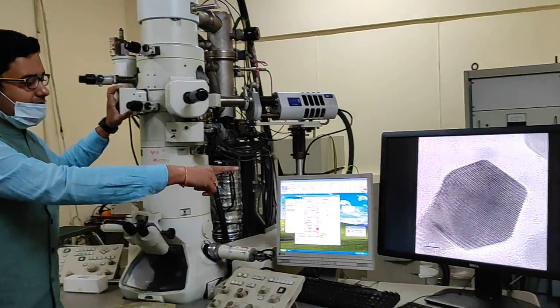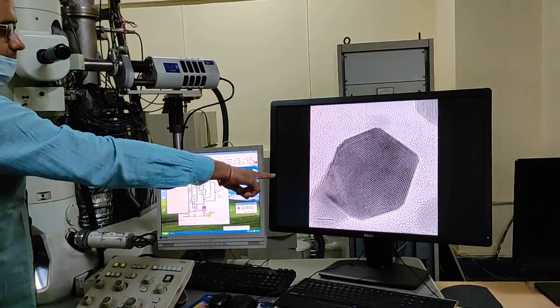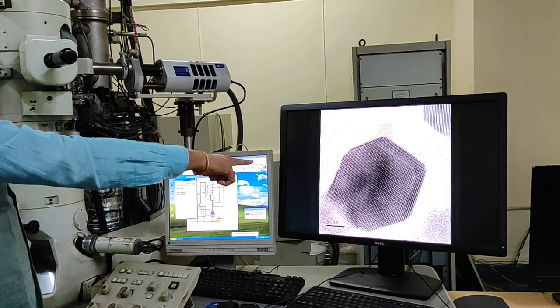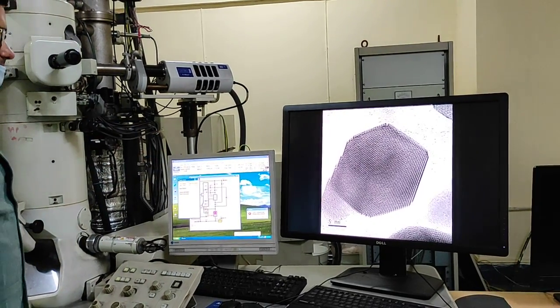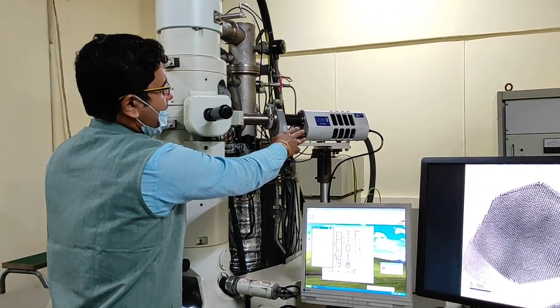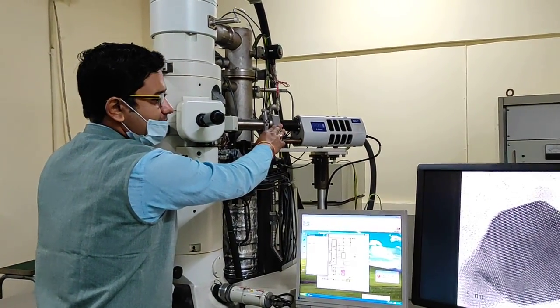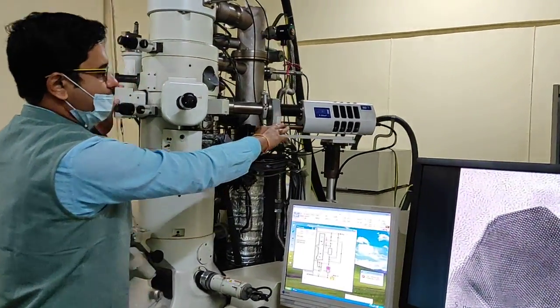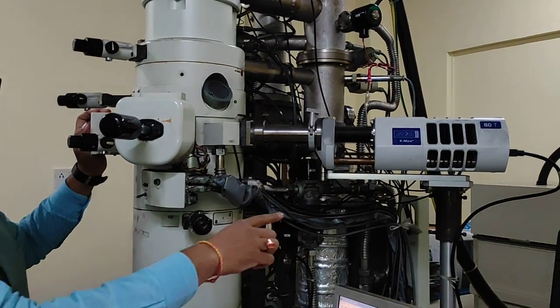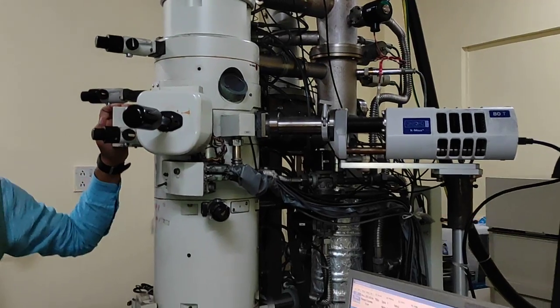These are the images you can see after the electron beam incidents on the sample. It is created with the help of the CCD camera. Other than this, we have the EDS detector. With the help of this EDS detector, we can do elemental analysis of samples, both qualitatively and quantitatively.